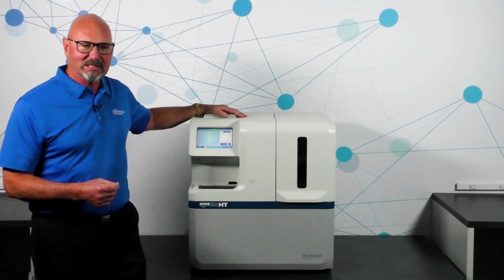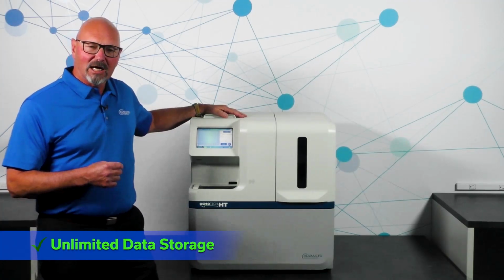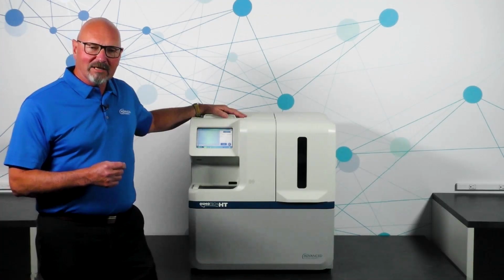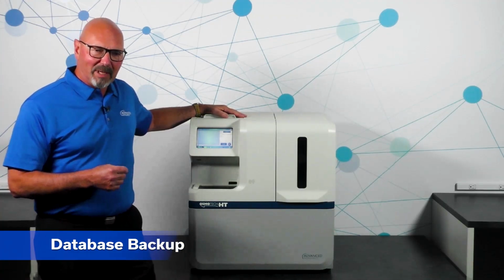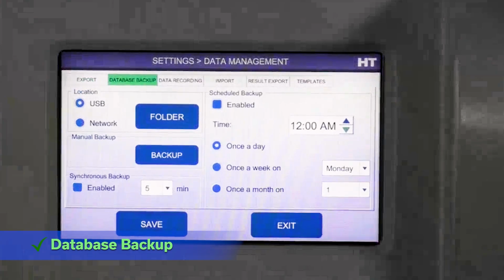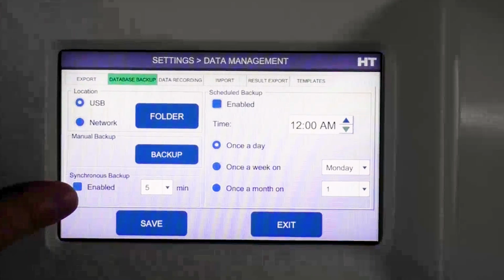All of these databases have unlimited data storage, particularly the events and the results database, and they can never be removed, altered, or deleted from the instrument. We also have a backup functionality, which allows you to export these databases as well as the configuration files to a network location. This is important in case there is ever a catastrophic failure of the instrument. You're able to restore those databases and configuration files to the instrument and start running from that date and time where the last backup file was done.